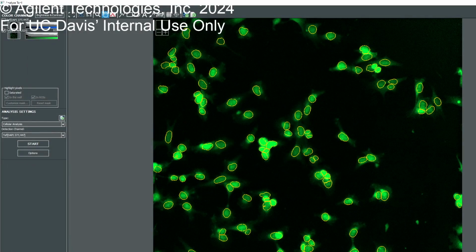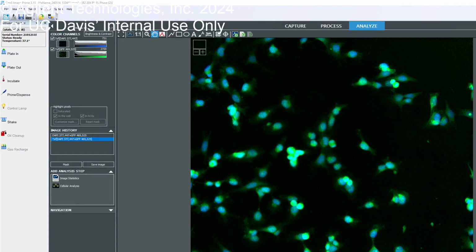And it's also going to dictate that here. So we have the total cell count, we have the cell count for the first population of large cells, and we also have a subpopulation for the GFP positive or overexpressing cells. So it's all pretty good. And we then can add this step to the workflow. Once we add this step to the workflow, it's again a part of your protocol.